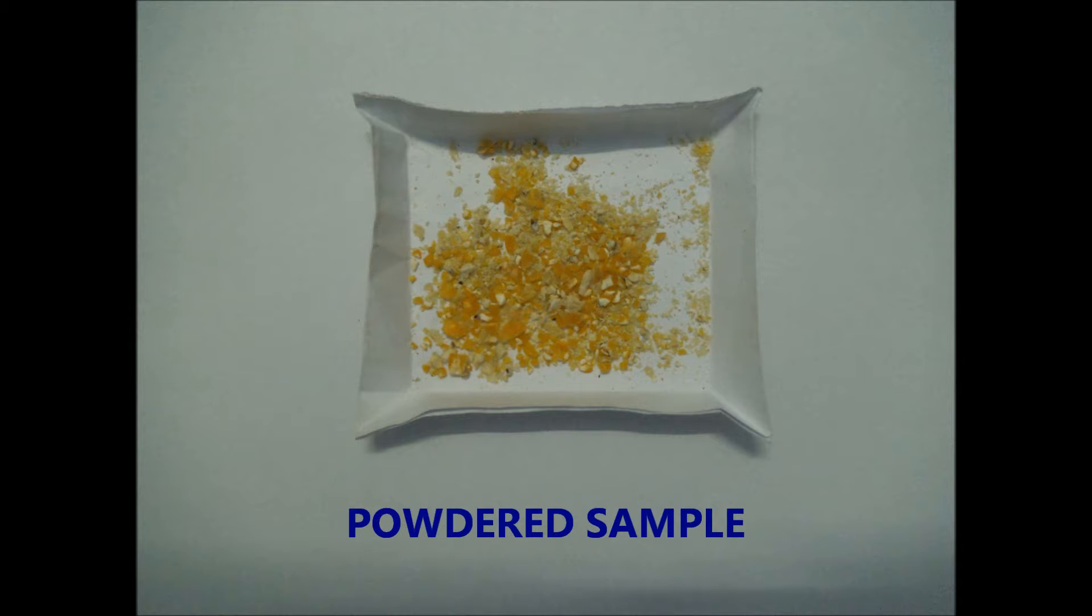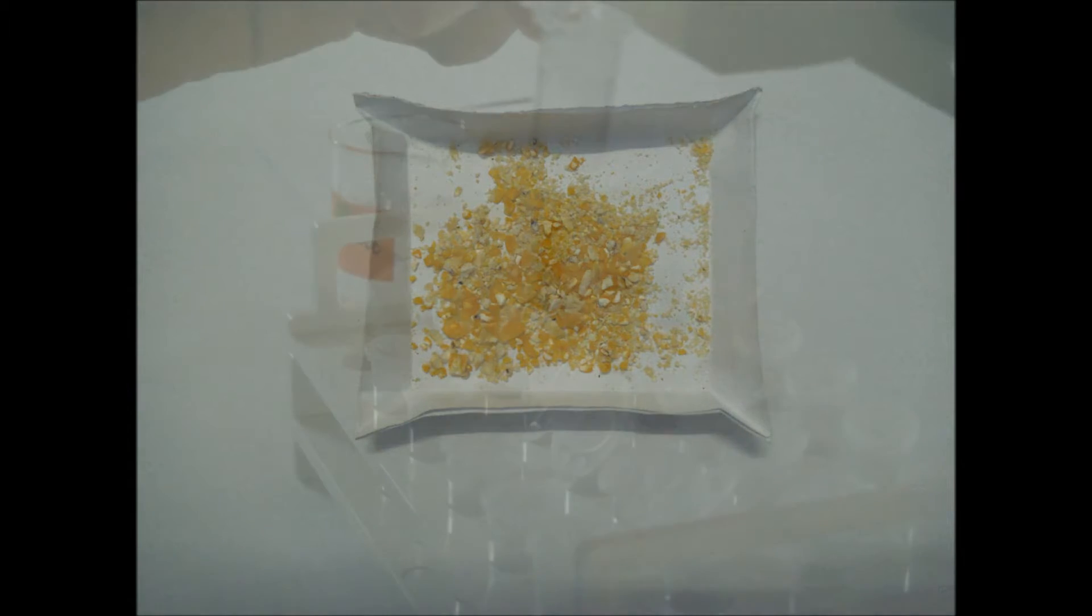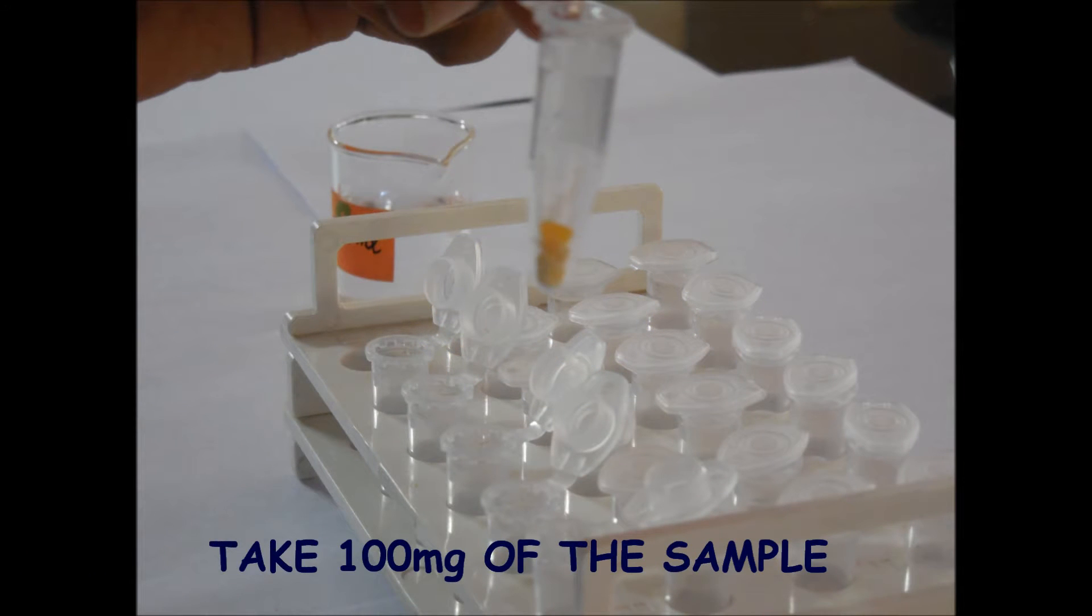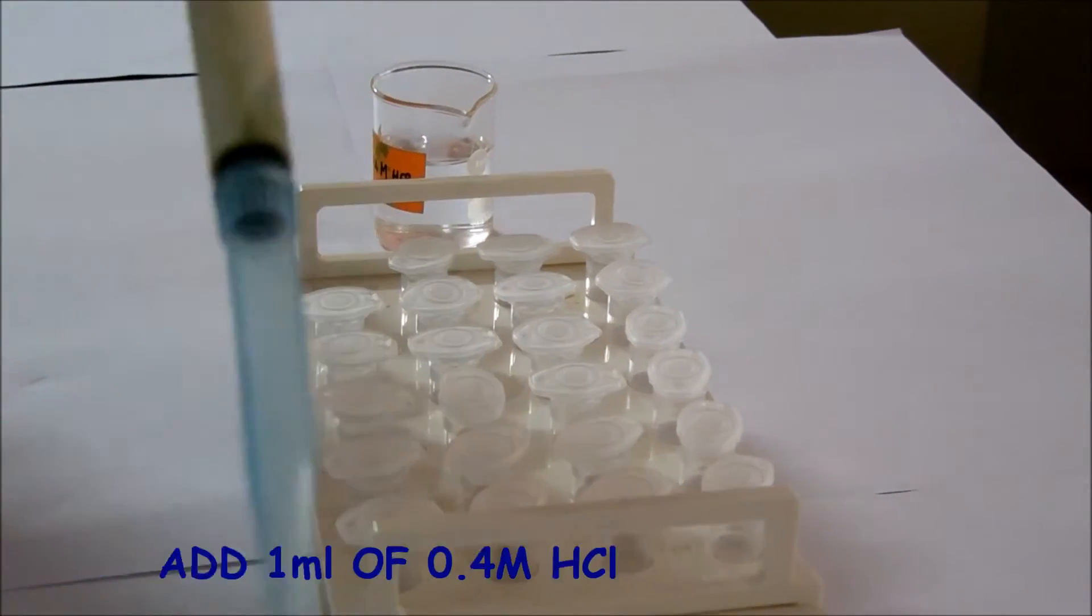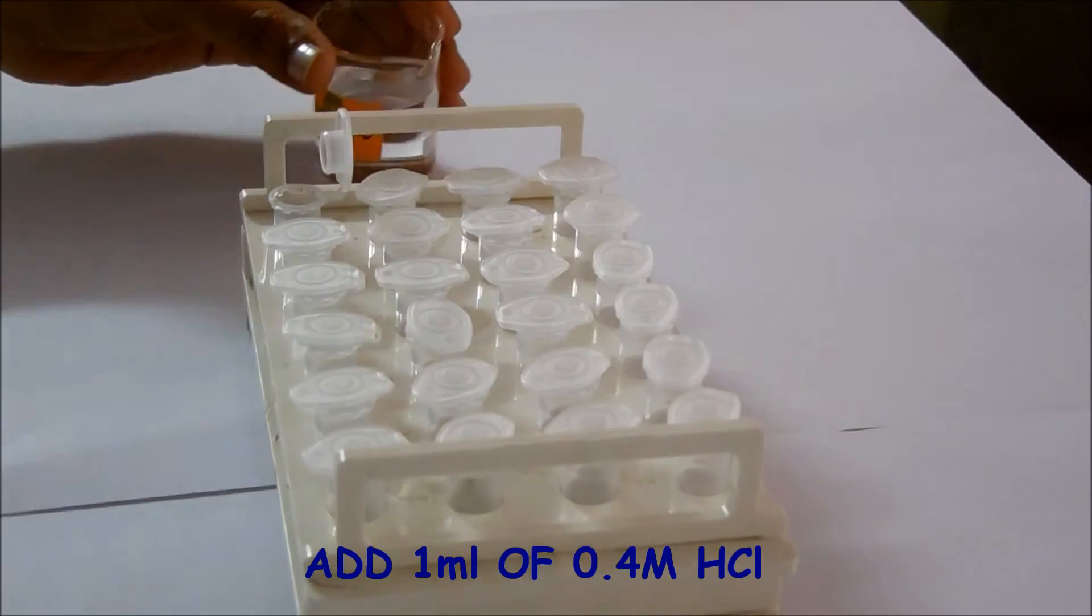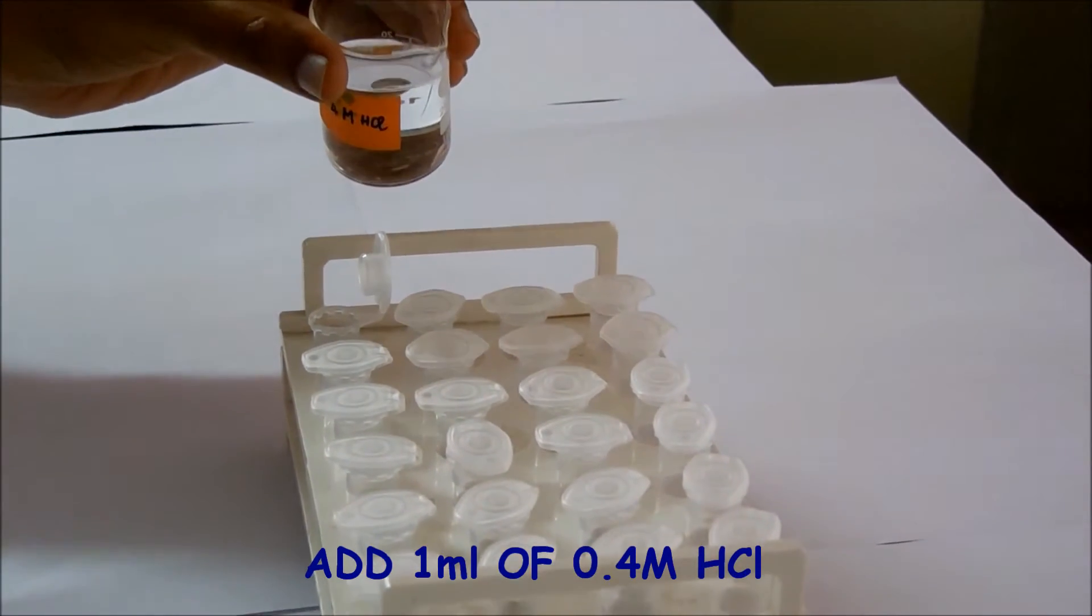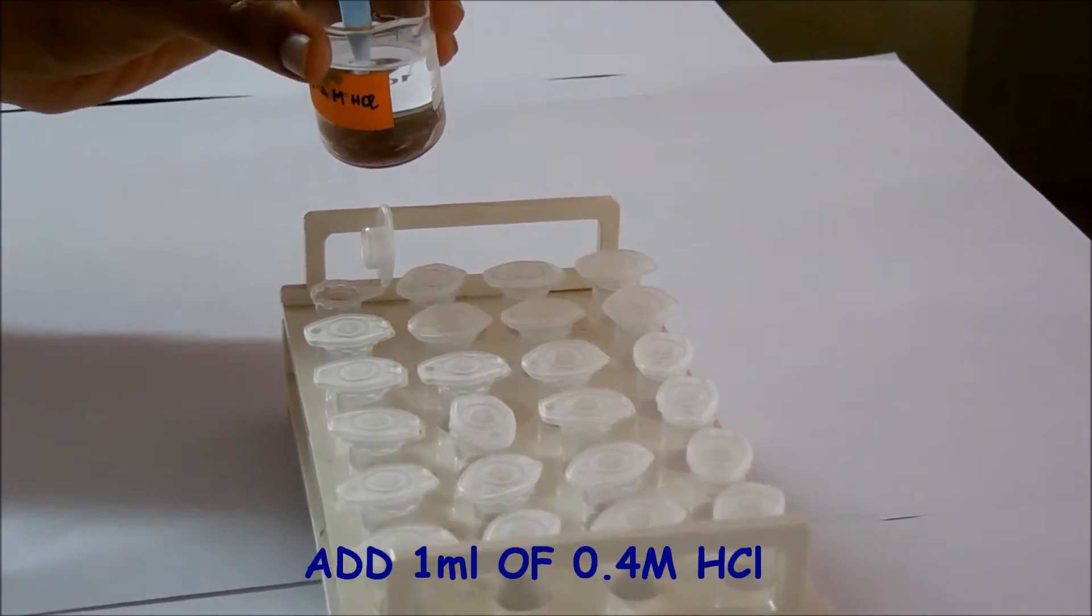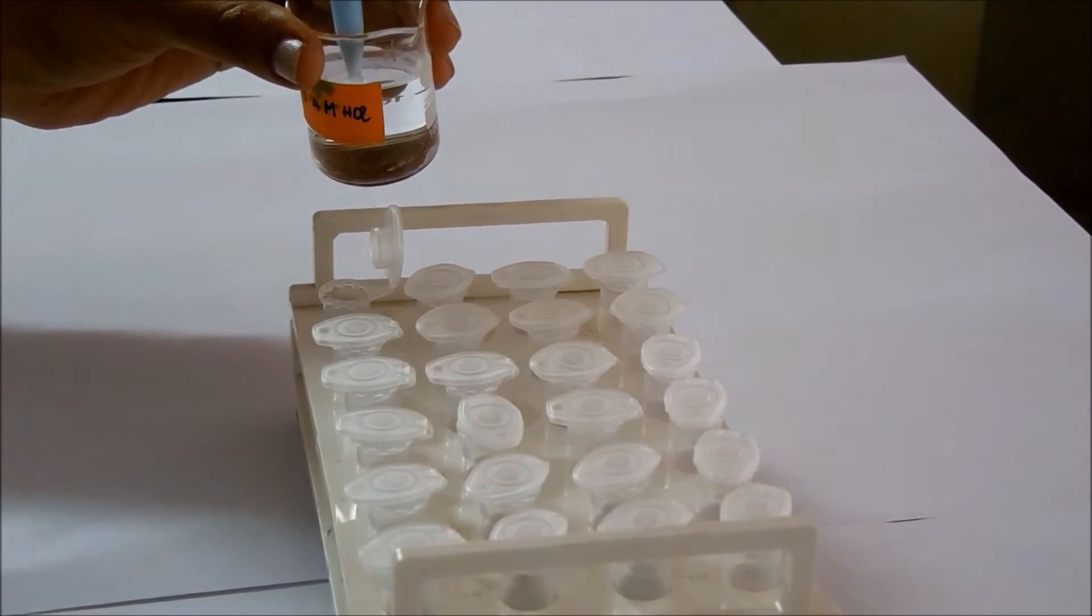Individual seeds were weighed and ground in a mortar with a steel pestle. Take 100 mg of sample. The resulting flour was extracted with 1 ml of 0.4 molar hydrochloric acid at room temperature for 1 hour.